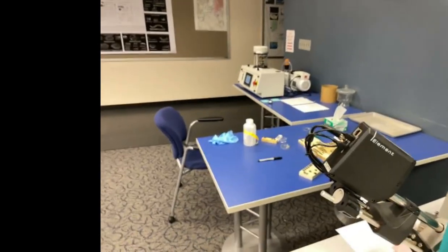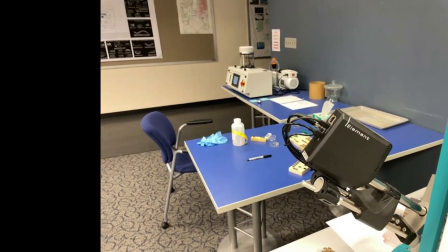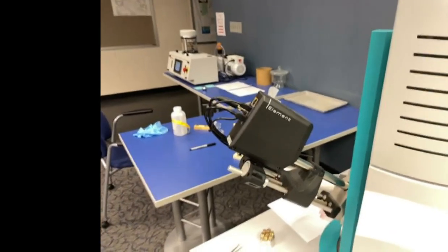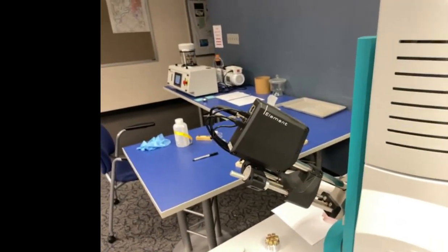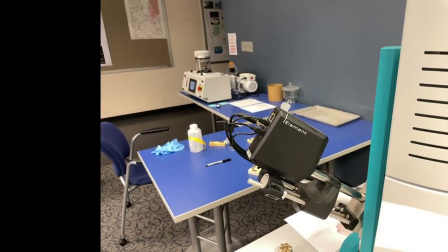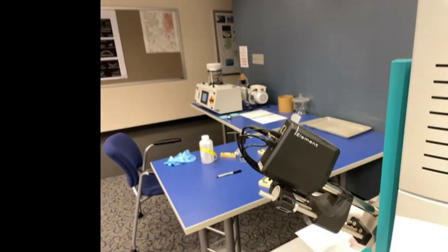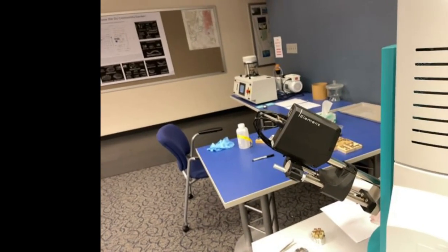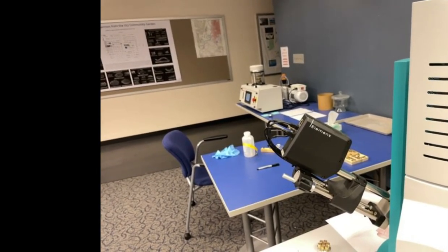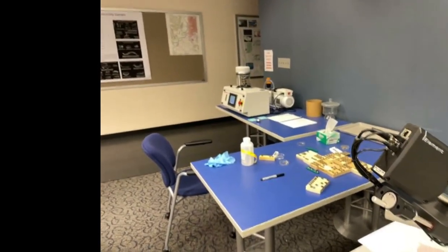Yeah, this is my lab in the university. This is the SEM lab. I have two. My other lab is a light microscope lab, where all my students are hanging out right now, hard at work, except for Laura here, who is hard at work screwing around with me on the SEM. So we're at Indiana State University. This is my SEM lab. And pretty soon we'll be looking at stuff in the same way that those little images in the bottom right corner were displaying. So we're going through the whole process of putting together the sample. It's probably vacuumed down enough, and then we'll start the sputter coating.